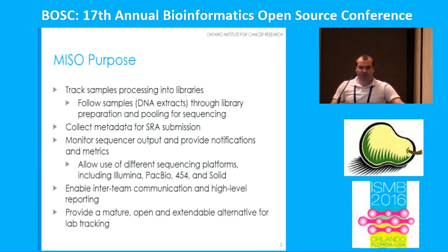So MISO is a LIMS that's meant to track DNA samples through library preparation and pooling for sequencing, and to collect the metadata for SRA submission, and monitor the sequencers, collect the output and provide notifications based on that. It handles a bunch of different platforms, including ones that I hope no one is using anymore, but you might have a solid sequencer around. And it does some inter-team communication reporting, and tries to be something that's fairly robust.